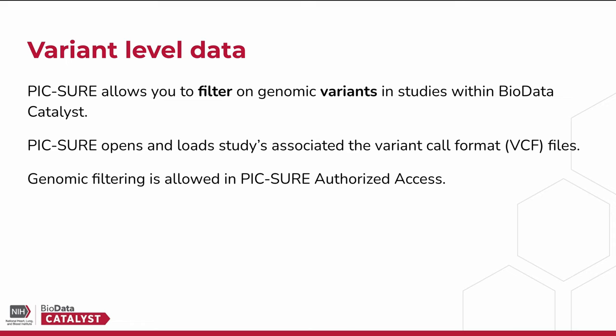In addition to allowing filtering on variable value level data, PICTURE also allows you to filter on genomic variants found within studies on Biodata Catalyst. This is because PICTURE opens the study's associated variant call format files and uses a pipeline to annotate the file. It is important to note that genomic filtering is a feature of PICTURE authorized access and is unavailable in PICTURE open access.